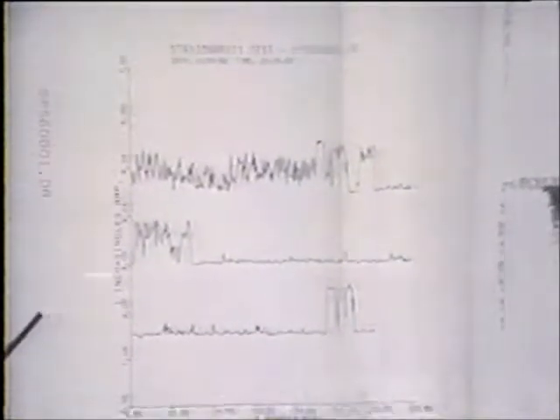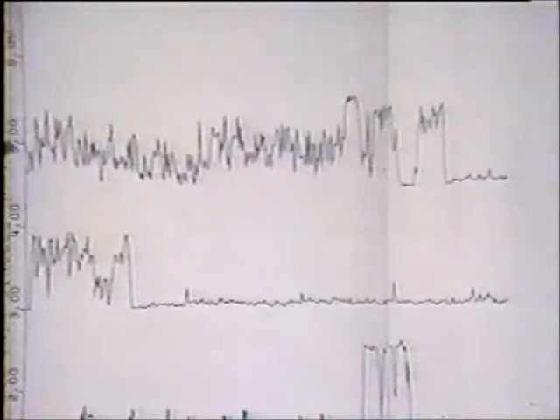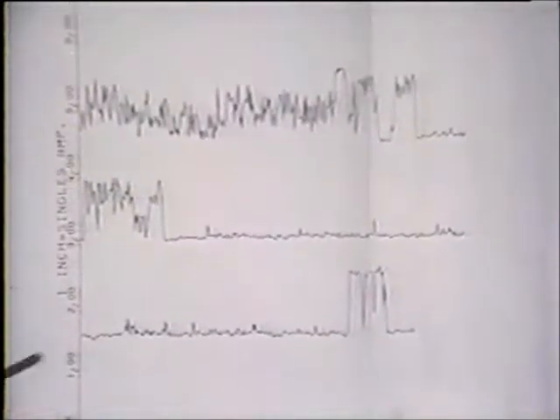This plot shows the average channel current as a function of time through the record. It's been averaged over about 1,000 points. Each data point in this plot is the average current over 1,000 data points from the other one. So it's a very low frequency version of that data.